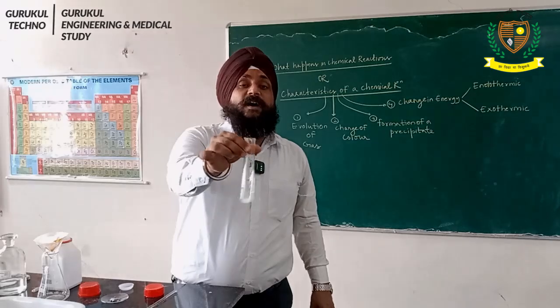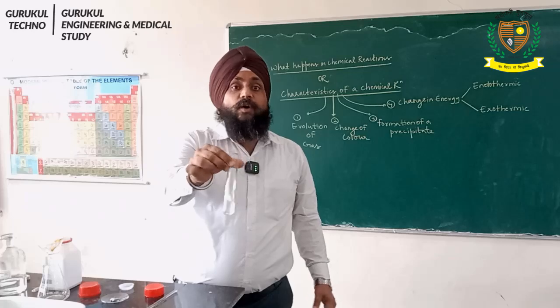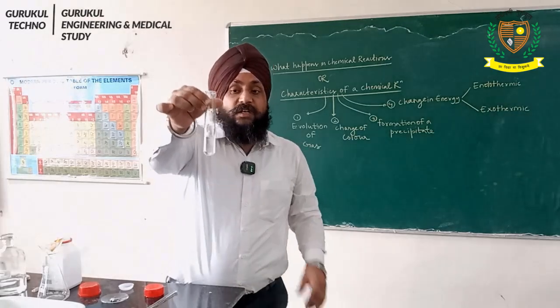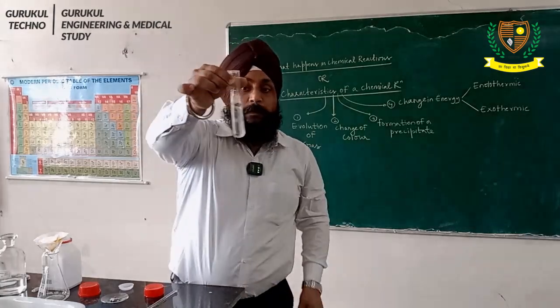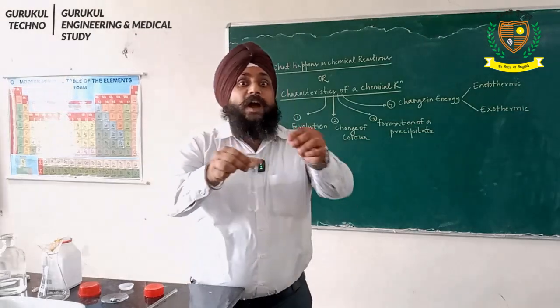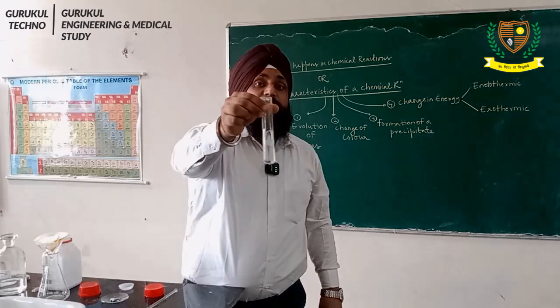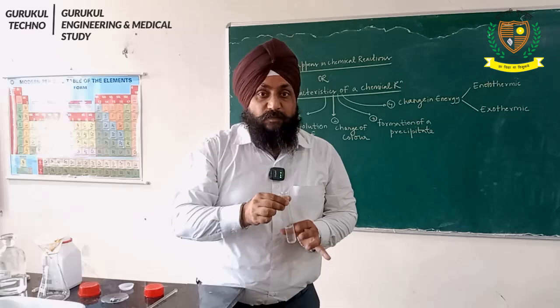It will become cold. So this reaction is an endothermic reaction. You can see that on the surface of this test tube, some water is getting condensed, just as when you put ice in water, water collects on the surface of the glass. Likewise, water is getting condensed on this test tube, which means this reaction is also an endothermic reaction.